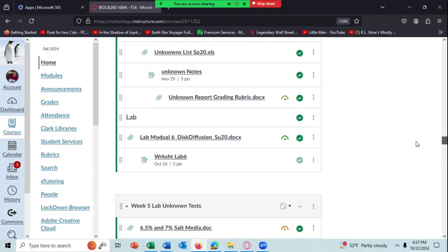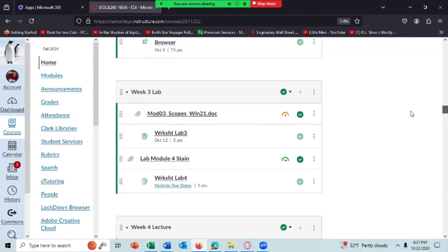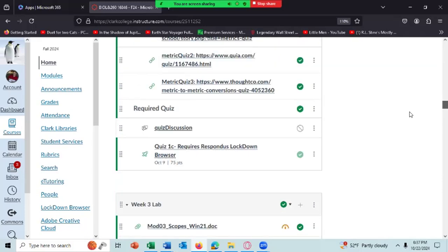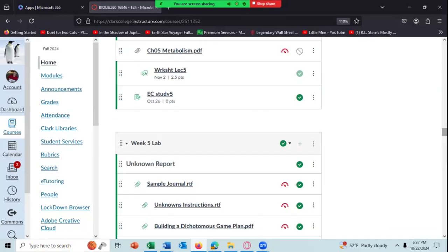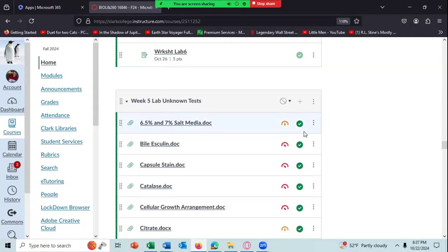And while we're talking about the unknown project, let me go ahead and open up all the tests you can do in the unknown. There it is. Week 5, lab unknown tests.